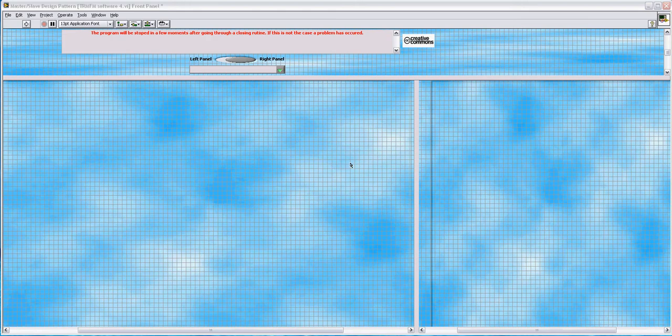In this video I will present how to configure an application. Now, what is an application? An application is a list of instrument drivers that we select that are going to be used during an experiment.